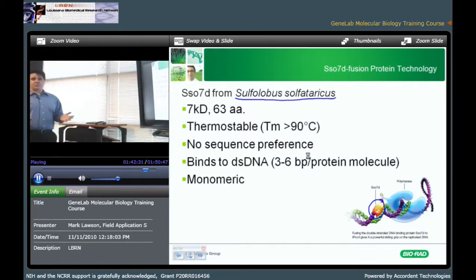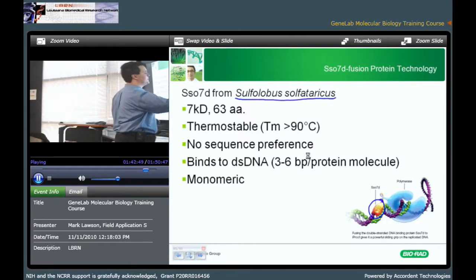I don't know if some of you know what processivity is, but it's how far we go with our polymerase before it eventually falls off the template. And it's really quite startling. The processivity of Taq is usually 10 to 20 bases. So to make a 200 base pair product, we need 10 separate binding and extension events. Let me draw a little picture here. The polymerase makes this product, falls off, binds again, makes another product. So we need lots of little events.